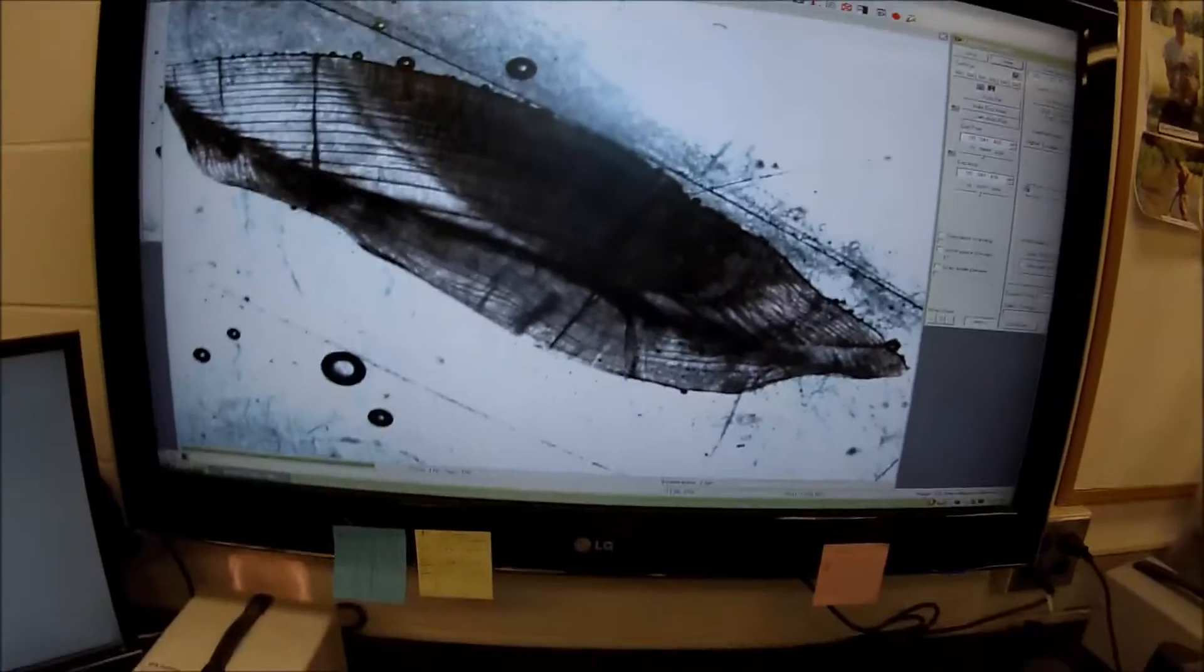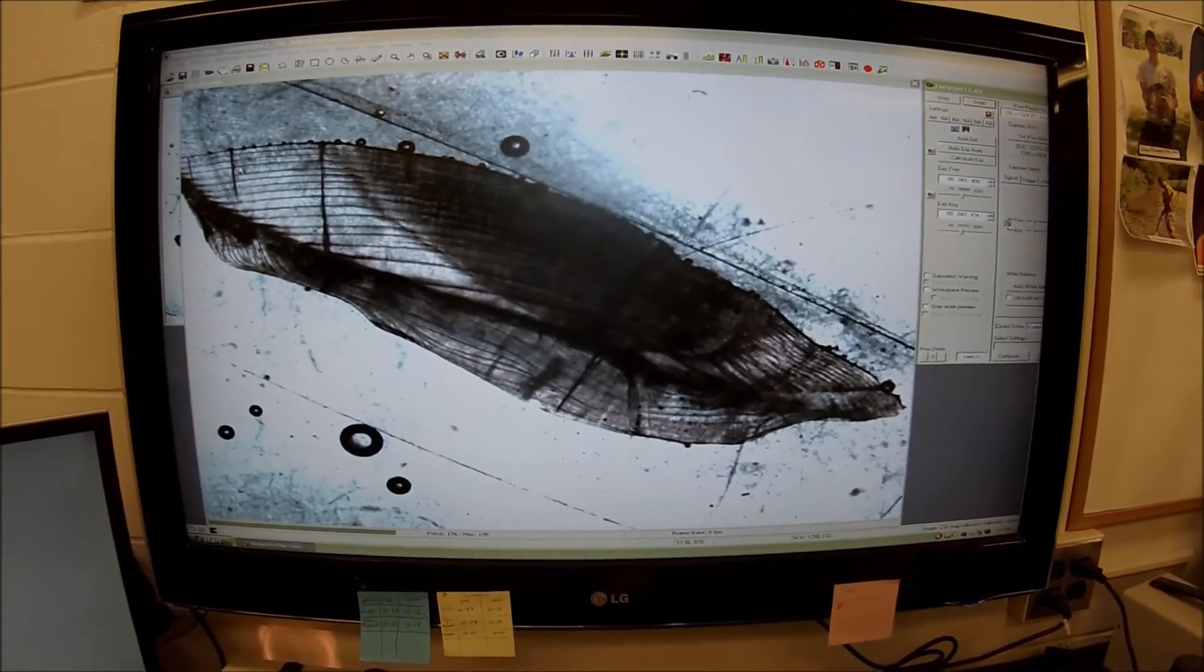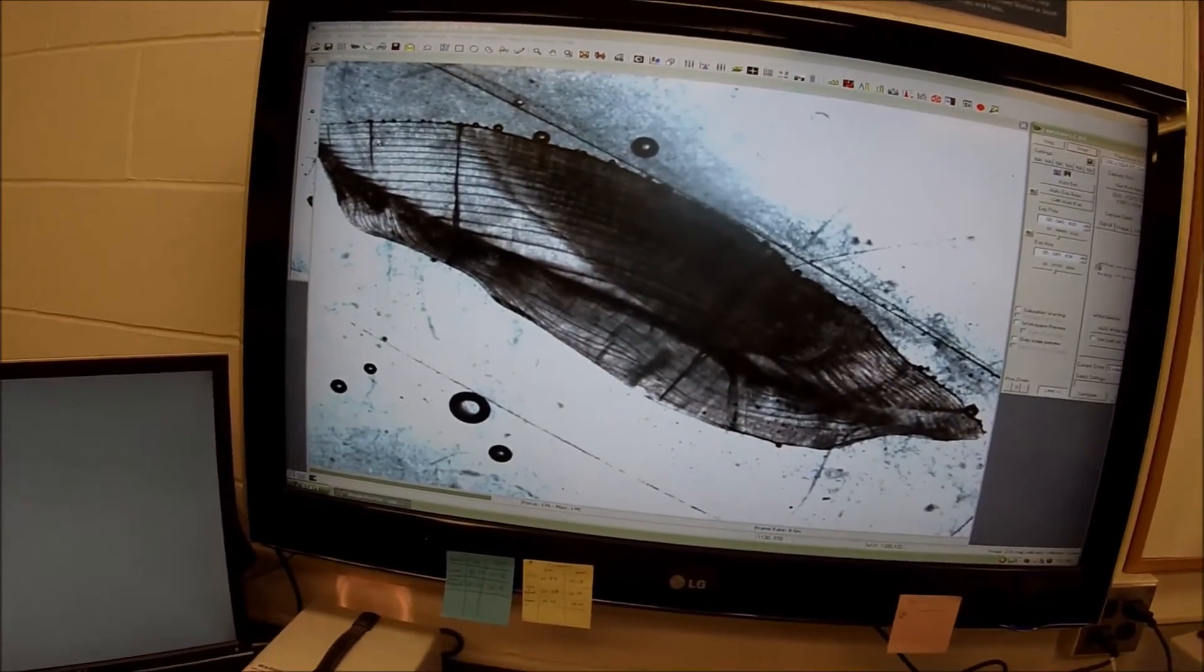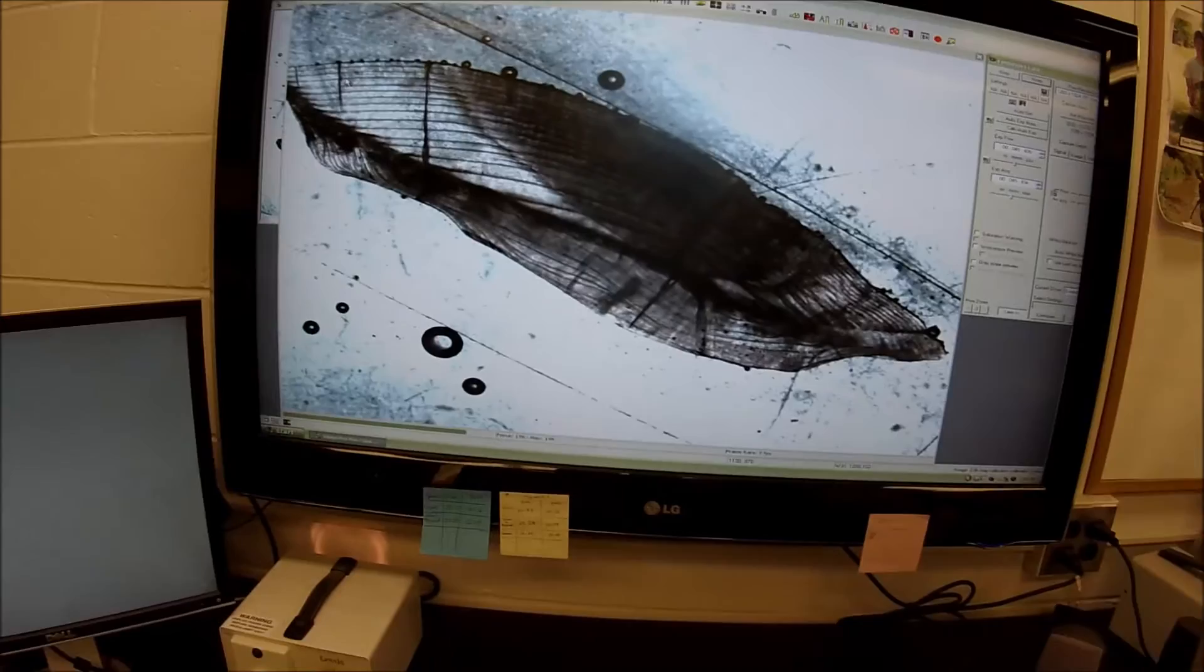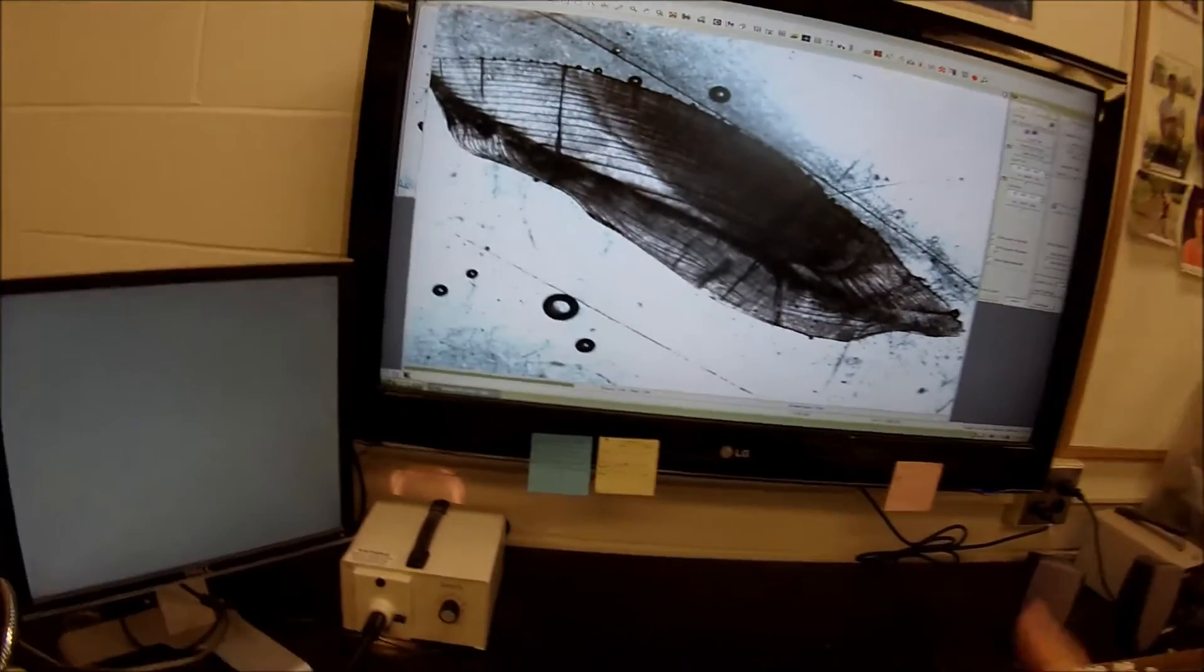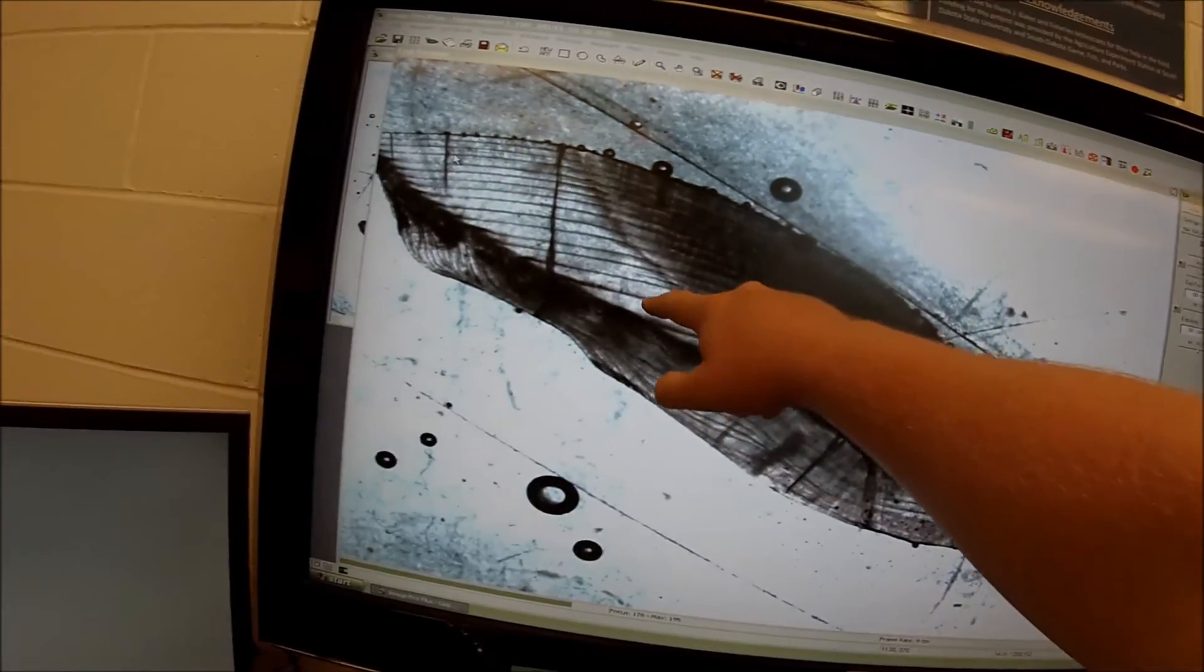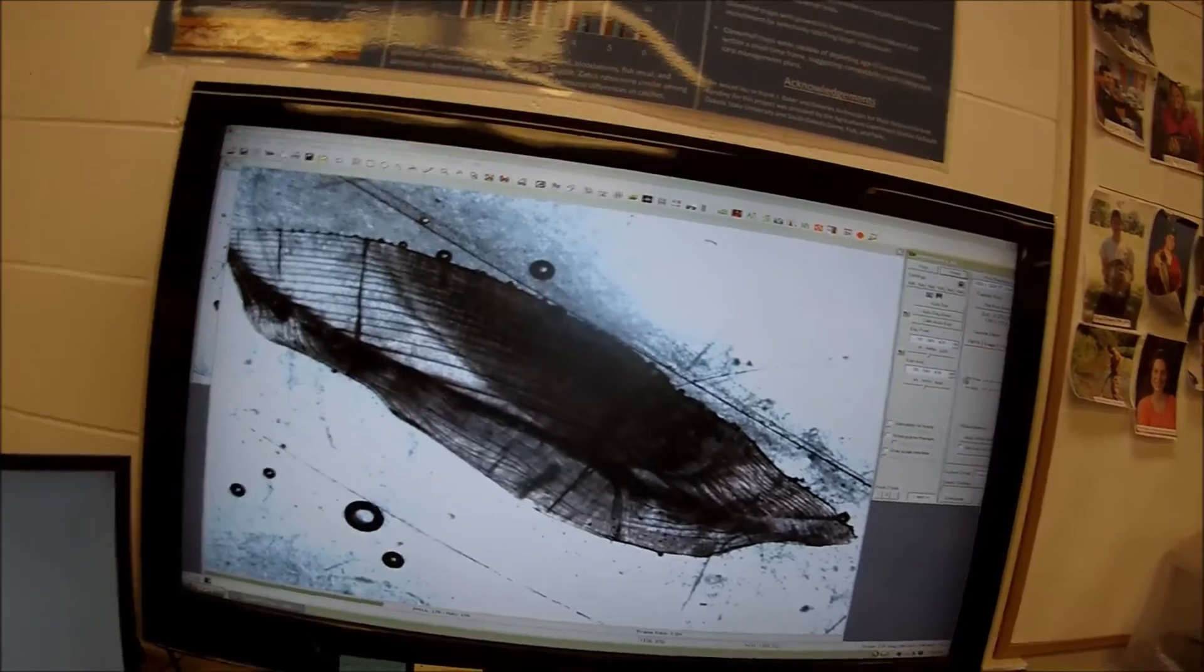So what are otoliths? So much like growth rings, well, they are growth rings. And essentially, the dark band represents a period of slow growth. That is, particularly in the northern latitudes, wintertime. Whereas this lighter band here is a period of fast growth or high growth. So the fish is born, first year of growth, basically the first summer of growth, first winter, second winter, third winter, etc. So it's a very effective tool and pretty darn cool.